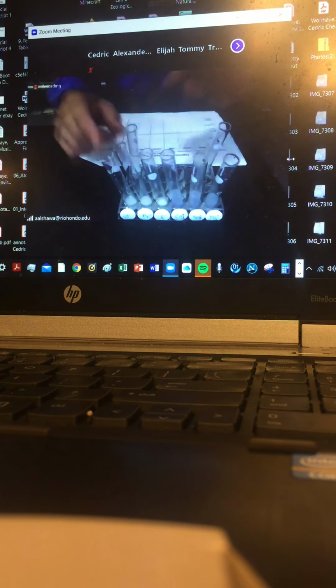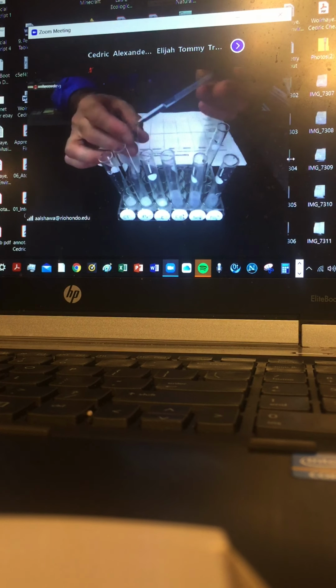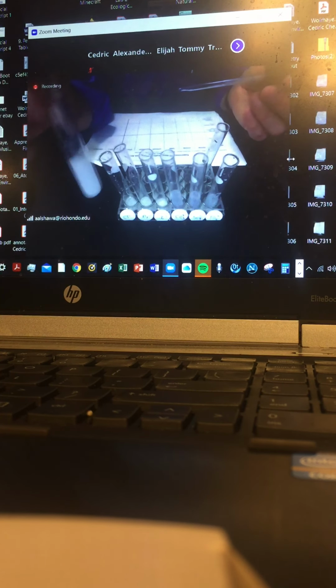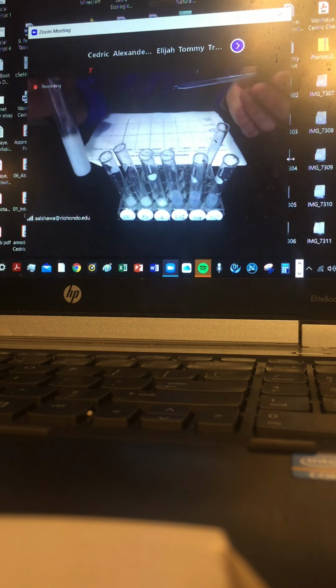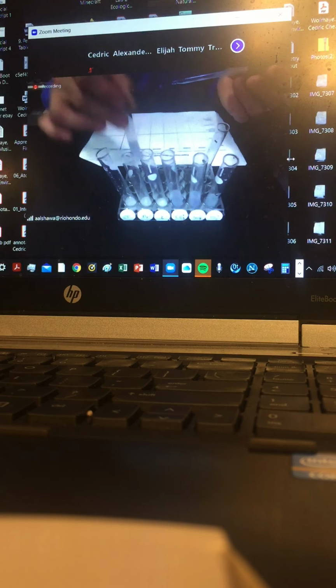Okay, so I'll do the same. I'll be adding nitric acid to unknown one. So it's the unknown one, nitric acid addition. So that solid maintained, did not go away. So that solid for the unknown one remains. Okay, resembles. So we don't have much to say.